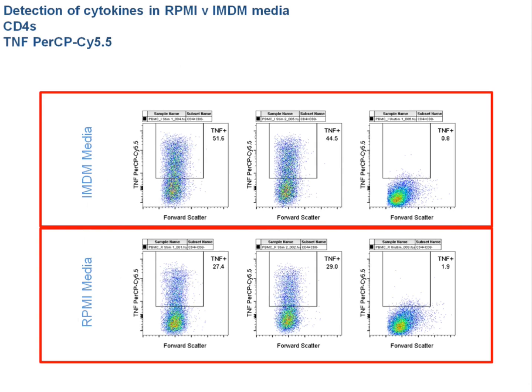For example, if it was a 3-day incubation, you mightn't want to block because it will affect the viability of the cells. So in that case, I would go towards blocking for the last maybe 6 hours. Often for the blocking, 6 hours is appropriate. So if you have a 20-hour stimulation, you can block for the last 6 hours. But to be honest, in some of my protocols, I have a 20-hour stimulation and I add the blocking agent, the brefeldin, at the same time, and I don't see a massive increase in cell death. So again, that's in my hands, but it's worth optimizing yourself.